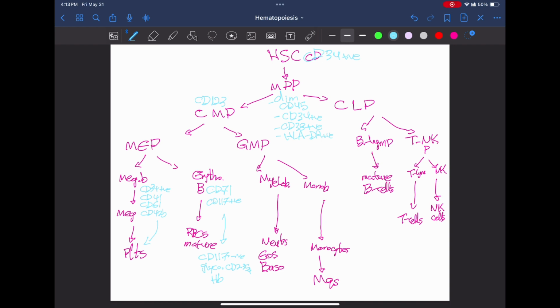Now, let's go for the granulocyte monocyte progenitor. These cells, the myeloblasts, are CD117 positive. This is a marker of immaturity. There are other markers that are expressed throughout myeloid differentiation. These include CD13, CD33, CD15, CD65, CD11B, CD16, and myeloperoxidase. Myeloperoxidase is the most specific myeloid lineage marker.